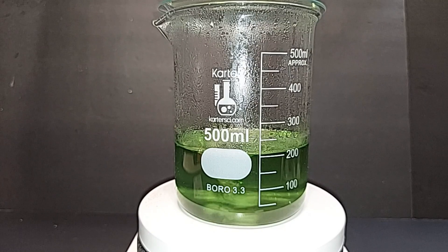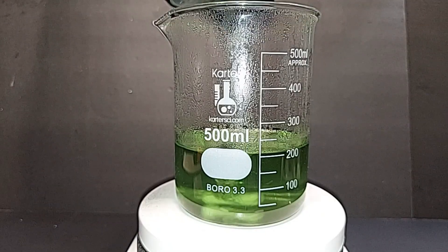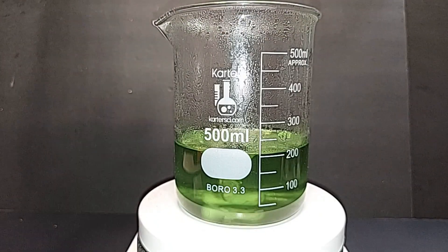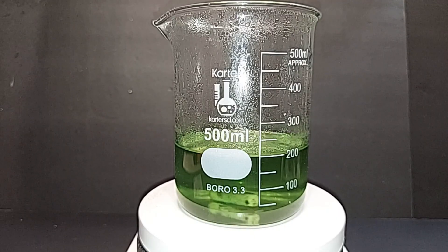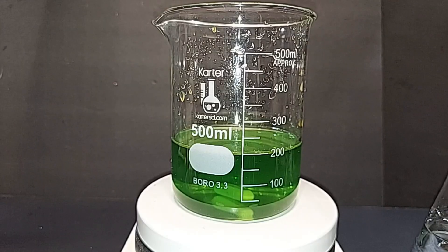It's almost all dissolved; small particles are adhering to the magnetic stirrer but those will dissolve when we add the hydrogen peroxide. No more hydrogen gas is being formed, and we're still at 200 milliliters — great. Turning down the stirrer and heat, then waiting for it to cool to room temperature before adding the hydrogen peroxide. It took about an hour to cool down.